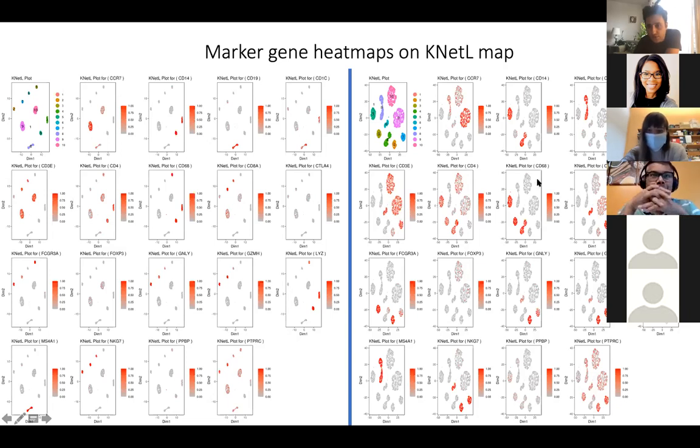And then we turn on CD8. You see these 2 are CD8 positive. One of those CD8 positive is GZMH positive as a marker. GZMH also sometimes comes up high in natural killer cells. You turn on KLRD, and it turns on in here. So the bottom one is your natural killer cell, and it's negative for CD8, as you can see in here.